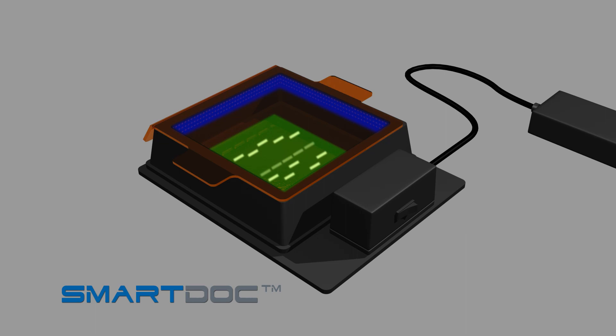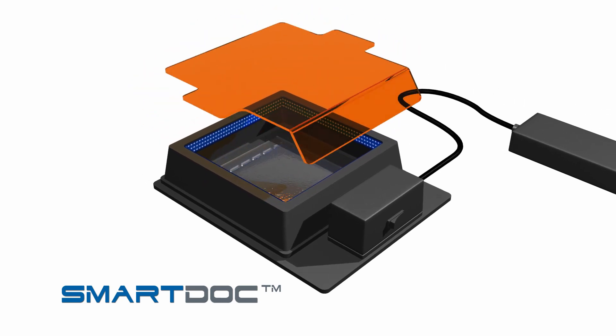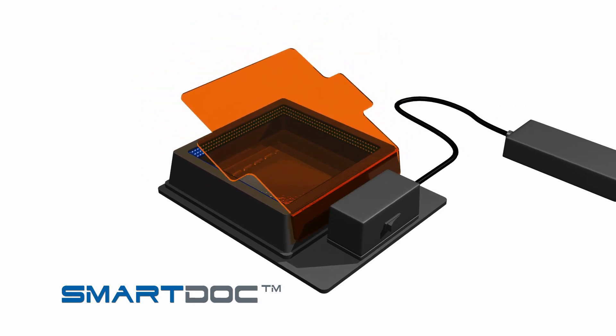With the SmartDoc lights on and the orange filter in place, your DNA bands are now visible in your gel. To access the gel while viewing and for cutting out bands, set the cover to its angled position.